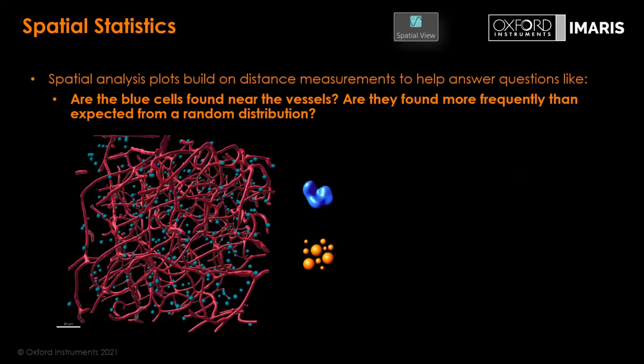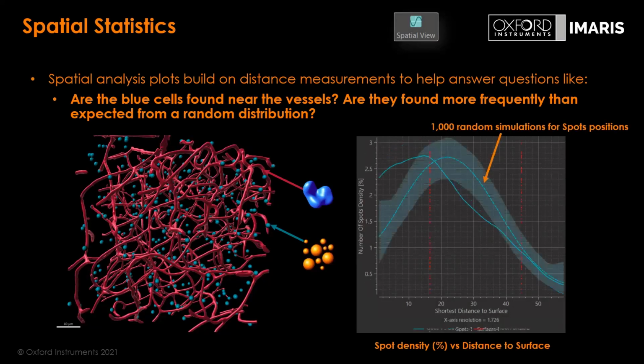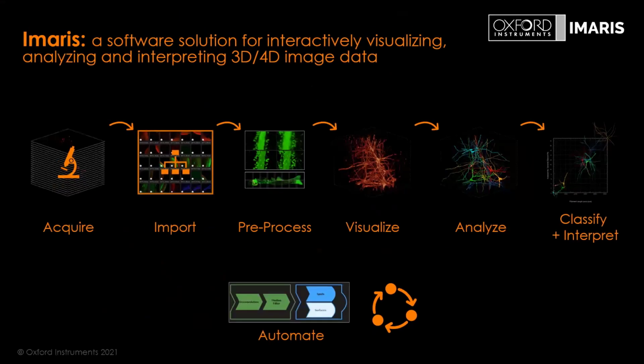Spatial statistics, we can see how far objects are away from other objects, and I'm going to show this real quickly in the hands-on session. So I'm going to skip over this a little bit fast here.